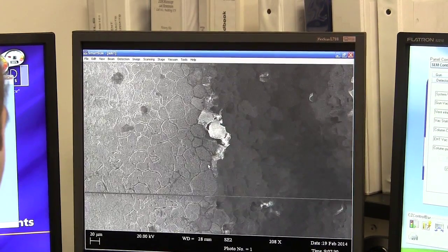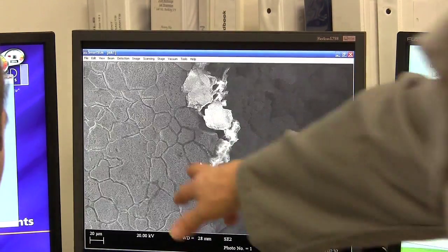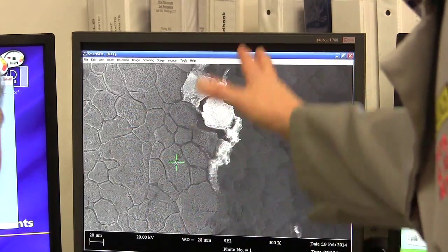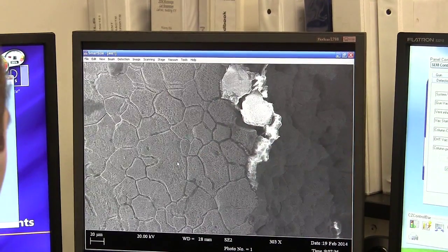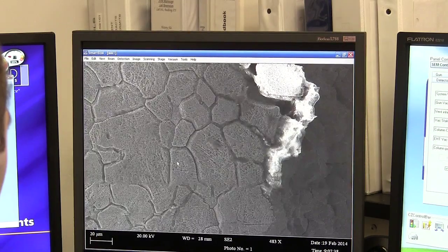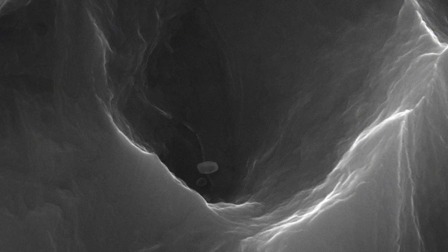So we now know what the sample looks like in almost three dimensions. As the microscope scans the surface back and forth, the data is used to create the image you see here.